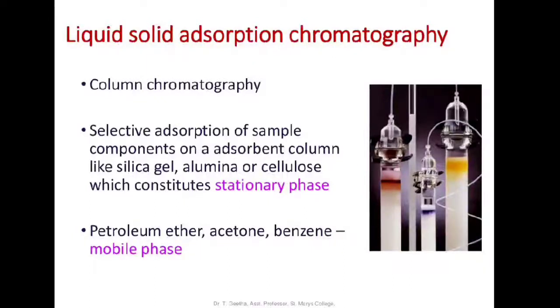Hello. In this session, we shall discuss column chromatography, specifically liquid-solid adsorption chromatography. As the name indicates, the chromatographic technique is based on the mechanism of adsorption. The main function of the column is to support the stationary phase. It is often a long cylinder made of glass with a stopcock at its lower end.